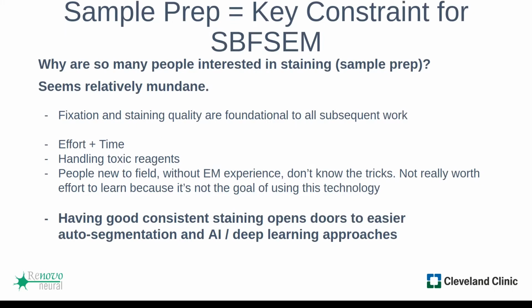So a key constraint for serial block face EM is sample preparation. And while staining is mundane, boring, and tedious, and sometimes very mentally painful when you have so many other things to do, because you have to stand around for hours and move hazardous liquids around with disposable pipettes, despite this, many people are greatly interested in sample prep, mostly to work towards reducing the challenges and bottlenecks that arise from it.